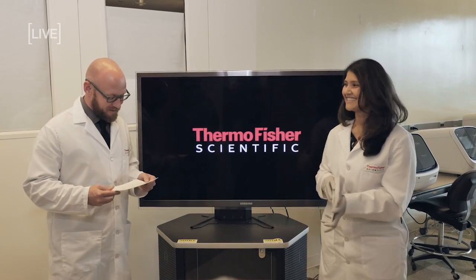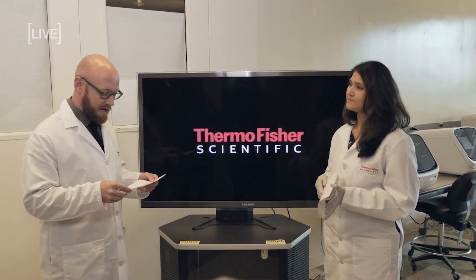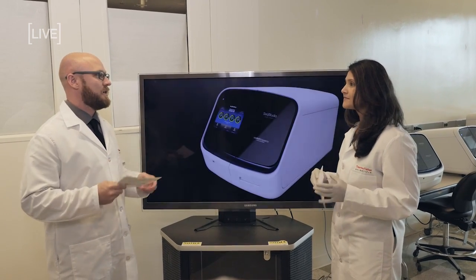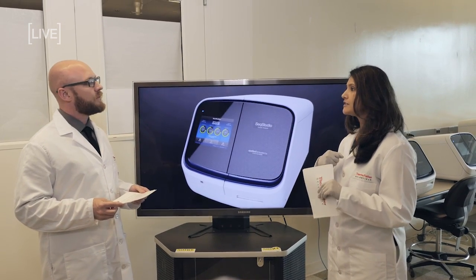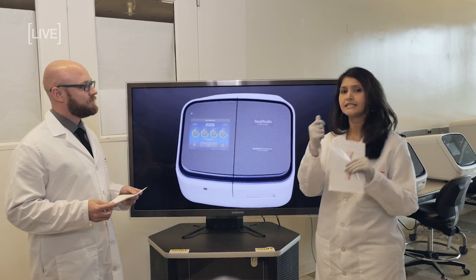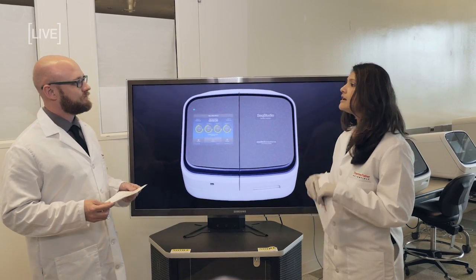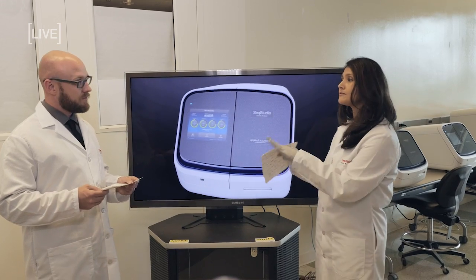Yeah. So each person can use their own cartridge in the lab. And how should they be stored in between runs or in between usage? Yeah, so in between usage, once the cartridge comes out of the instrument, customers should put on the integrated capillary protector, or the ICP, to make sure the capillaries are moist. And the cartridges can be stored in the fridge for up to 4 months, or on the instrument for up to 4 months as well.